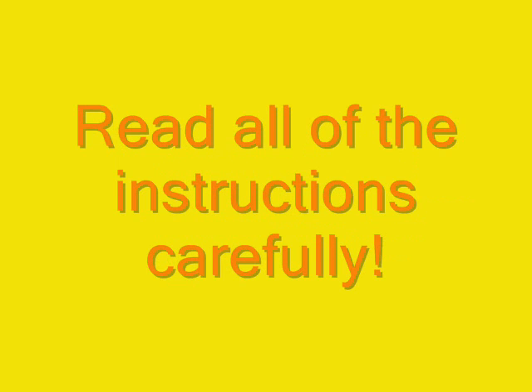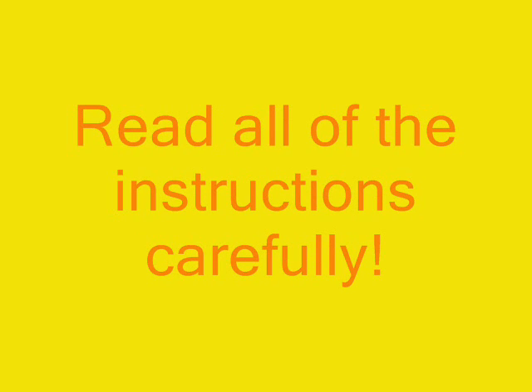As always, before you begin the lab, read all of the instructions on the lab worksheet carefully. This video will show you the techniques needed to correctly test the acidity of each sample. Your grade, however, will be determined on how well you follow the instructions on the lab worksheet and on how thoroughly you answer the discussion questions.